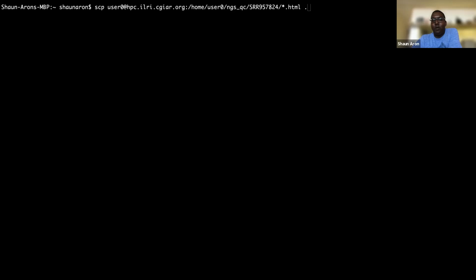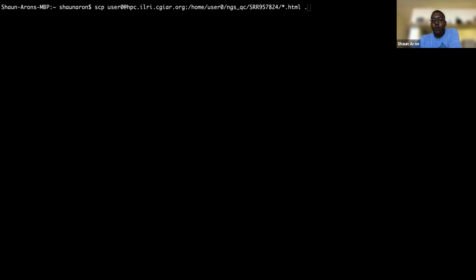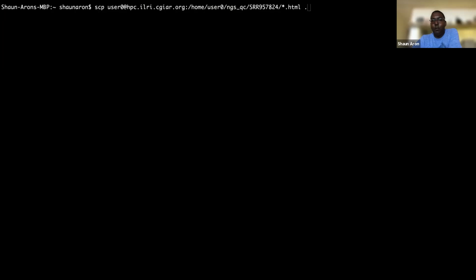If you have got your FastQC results for the forward reads, please just put a hands up next to your name if you've got the fastqc results opened in the browser for the forward reads. Just put a hands up next to your name, please.